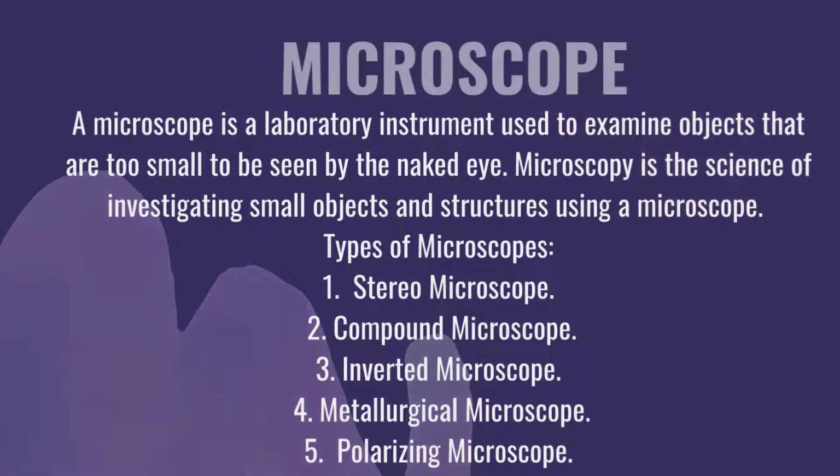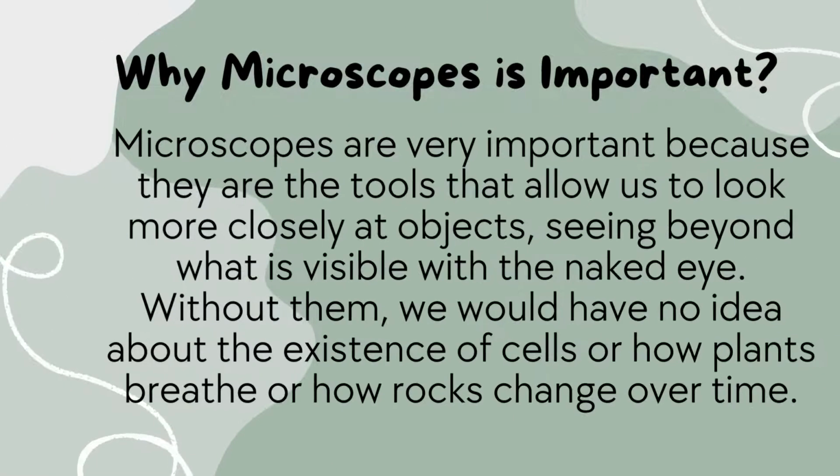Dear students, microscopes are very important because they are the tools that allow us to look more closely at objects, seeing beyond what is visible with the naked eye. Without them, we would have no idea about the existence of cells or how plants breathe or how rocks change over time.